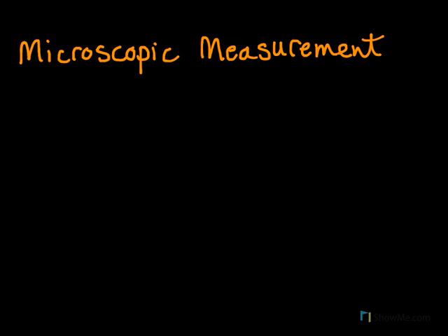Okay, welcome to this video of microscopic measurement. Today we're going to determine how to measure the diameter of a field of view under microscopes and also determine or estimate the length of a cell by knowing its diameter.